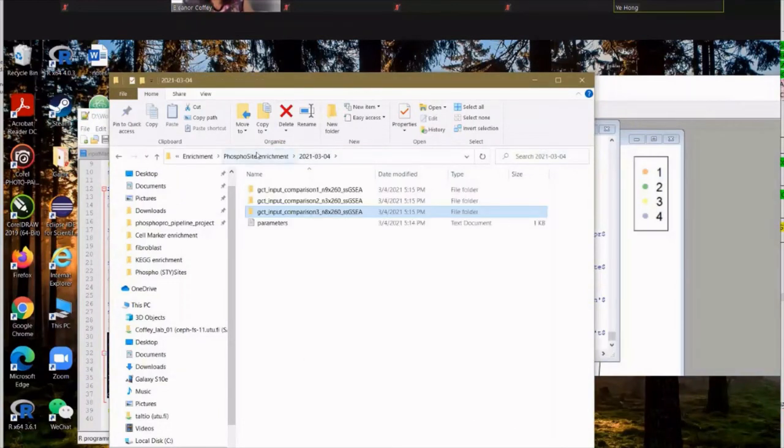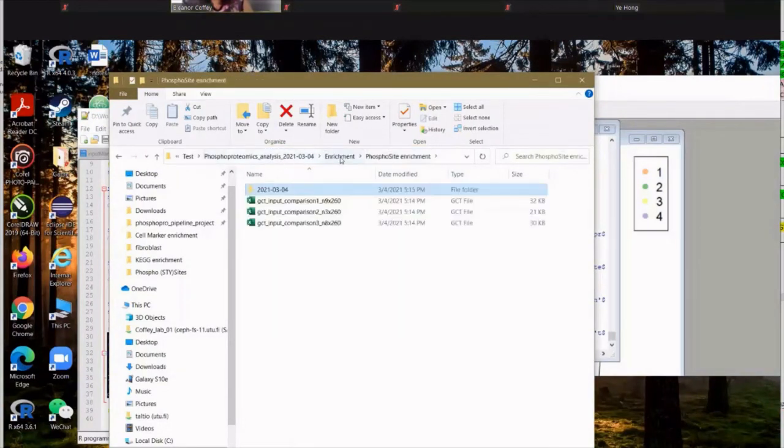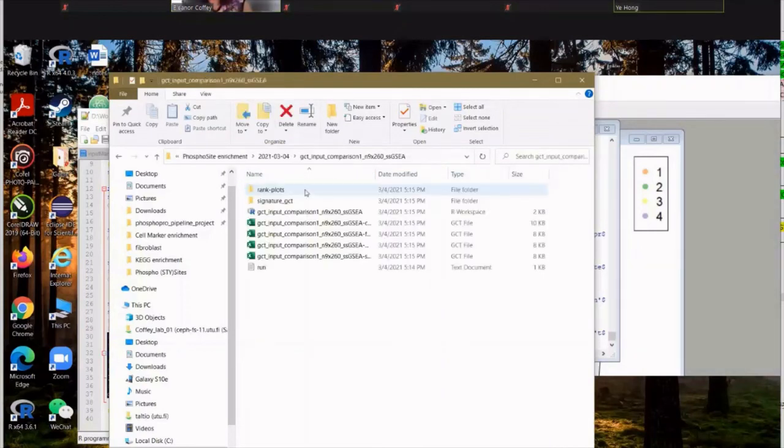So those are based on motifs, right? These are based on peptide signature sets. So they have a signature set that has some. Now I got it. Yes, sorry, I asked you this before. Does everybody understand that? No questions. Yeah, they must understand.